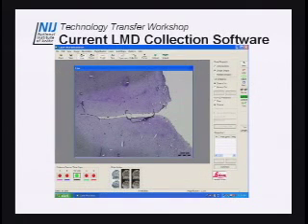The current software, I just put this in so you have that information, is very similar and has some more features, which are great. We're very excited about these new instruments. Kelly, Pat, and I have seen how much faster they are than our older instruments, and you're lucky. Some little technical difficulties that we may have had in the past are solved with the new instrument.